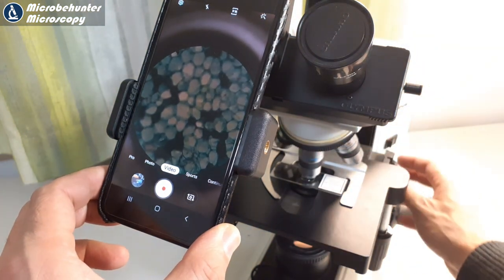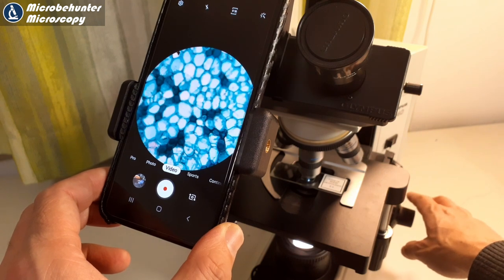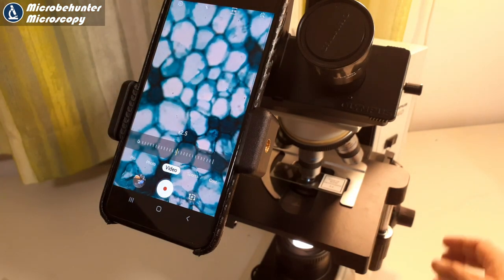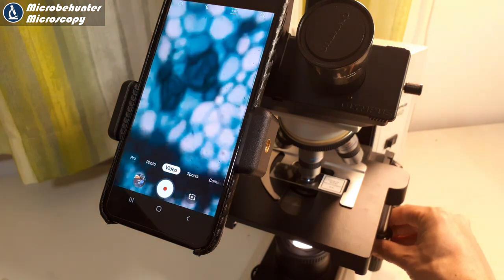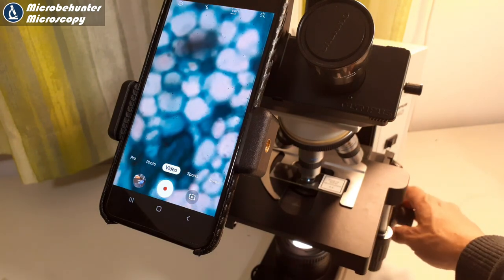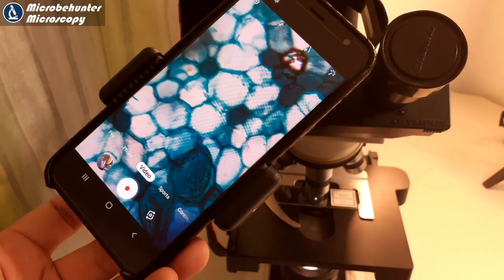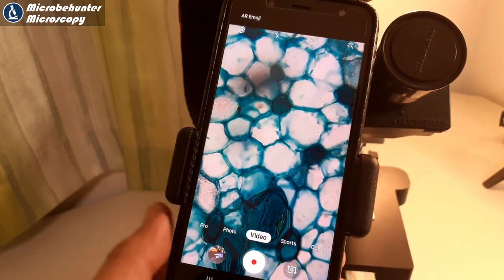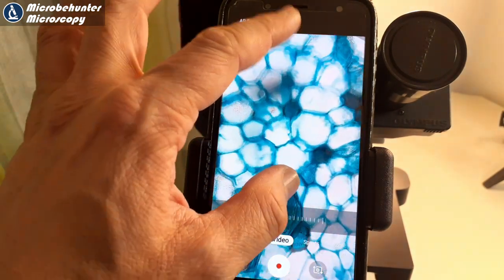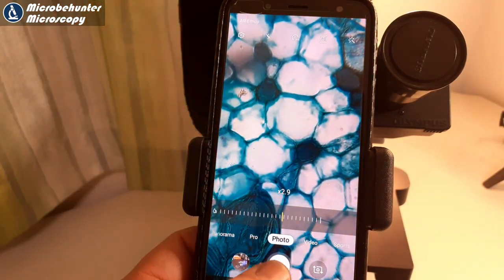The only problem is that the mobile phone tries to refocus on its own, and this can be quite annoying sometimes. When you focus with the microscope, the mobile phone tries to adjust this, because of course it always wants to get the picture into focus. Maybe there are camera apps that allow for manual focusing - I don't know yet, I have to look around. You can see that it's trying to refocus all the time - that's kind of annoying. That's a disadvantage of mobile phone systems over camera systems which allow you complete manual control.